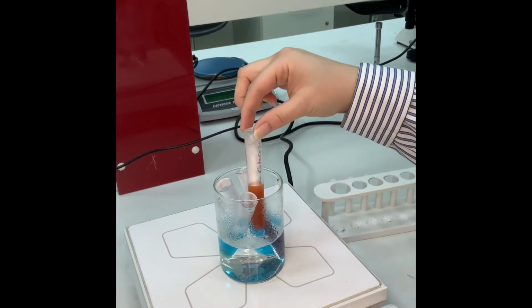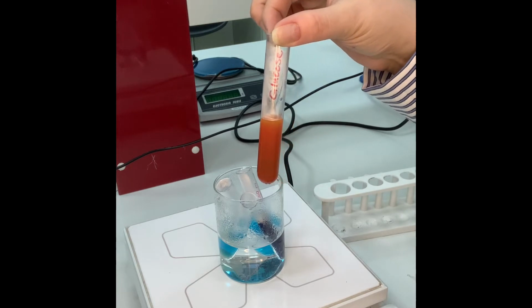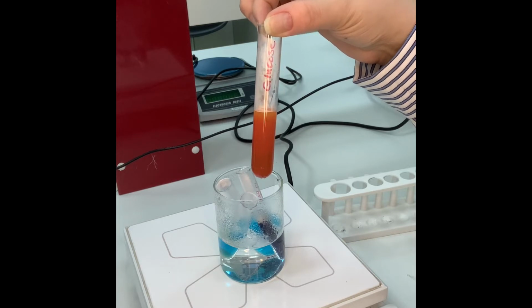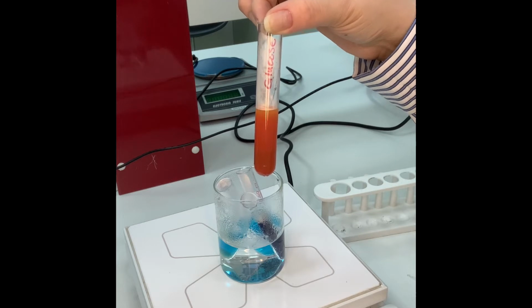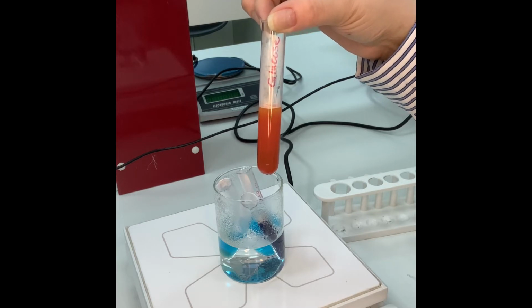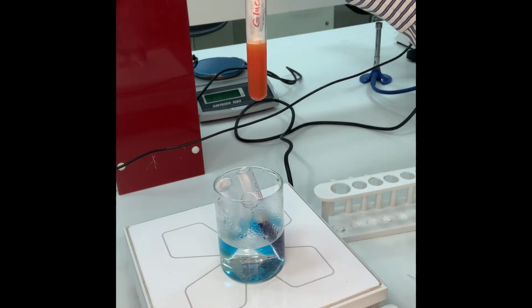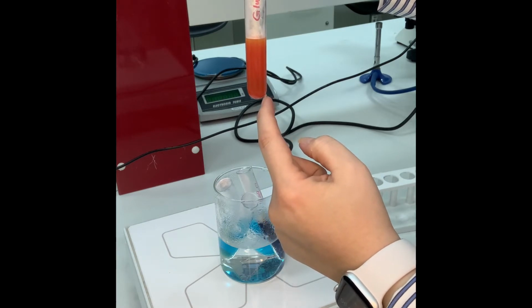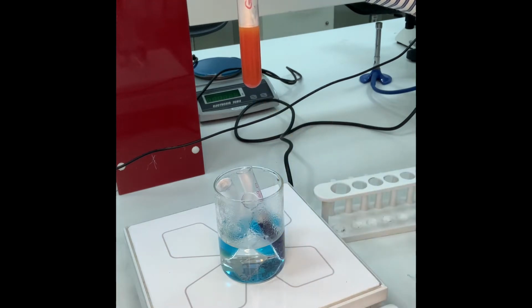Now I need you to look at the glucose. Look how it becomes a coloration, reddish into yellowish, and this is why we call it brick red coloration, because it is in between the colors. And if I keep it standing for 1 hour, that redness will precipitate at the bottom of the test tube, which I will show you after 1 hour standing. Okay, so wait for the result till then.